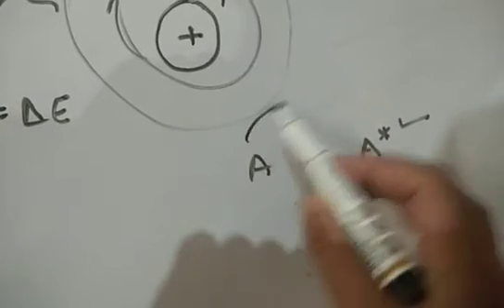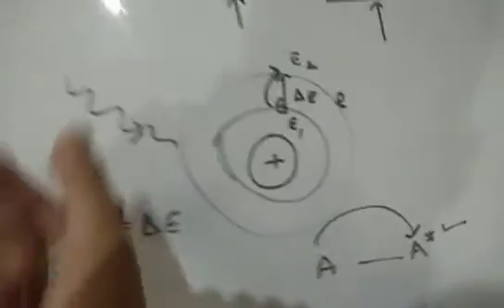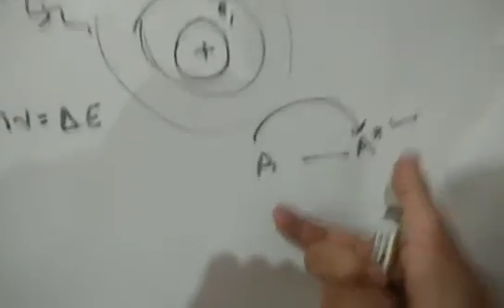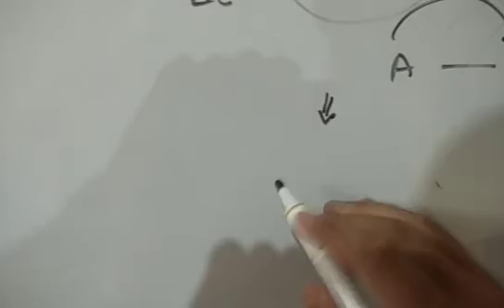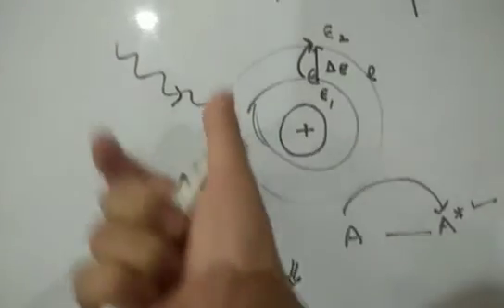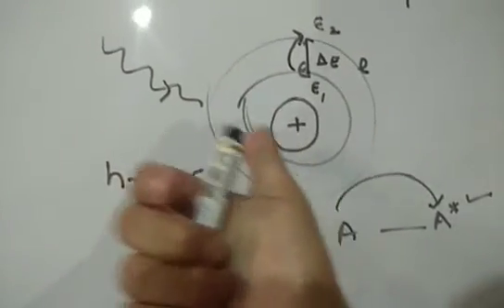So this ground to excited state conversion upon interaction with the radiation, इस phenomena को हम utilize करते हैं for quantitative and qualitative analysis.